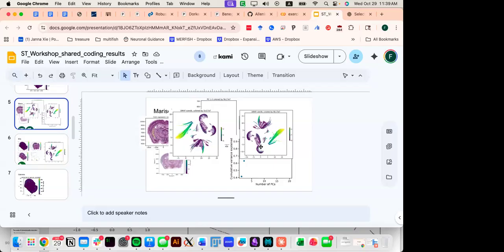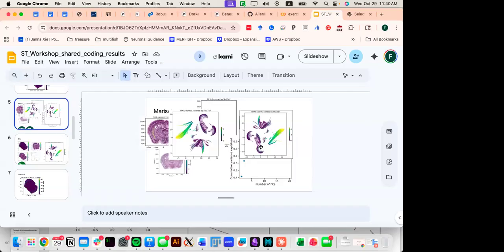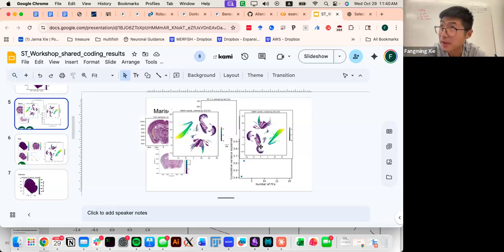I see. So basically the clusters of cells that are similar to each other will be mapped near each other no matter what iteration of UMAP. Yeah, that seems to be stable. I was just trying to figure out what I had done to change the visualization and I couldn't figure it out, but thank you for explaining that. No worry. So think of it as UMAP trying to find a solution where many answers are equally good answers to the same question.